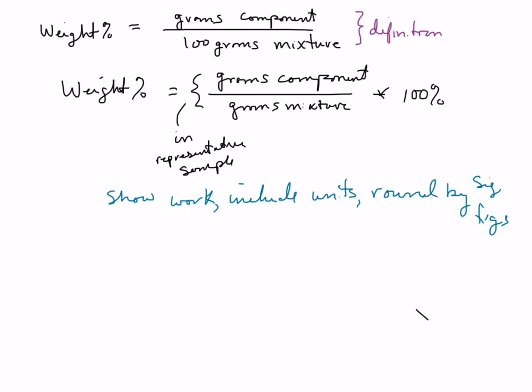It says mass of component and container, so should you tear it out before you put the container and the component? Exactly. You're going to tear it out, weigh the empty thing, and then leave it tared out, or tare it again if you want to, but then weigh back with the component and the container.